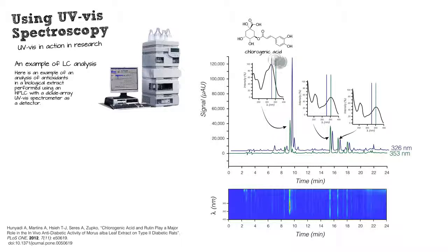These are the compounds that came out of this sort of dietary extract from a rat, I suppose. And so here we have this chlorogenic acid. Notice the polyphenolic compound here. That's going to be your chromophore. You're not going to see a lot of UV absorbance from this, or certainly nothing in the range we're looking at. That's where you're going to get your absorbances around 300. And that's a very different chromophore than we see in this rutin molecule. We still have the polyphenol, but now, instead of being conjugated just to this ester group, it's conjugated through this whole second polyphenolic compound. So you can see why the spectrum here looks very different. And there's a couple of sugars attached to that.